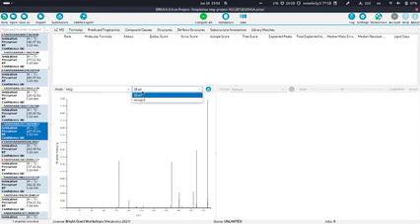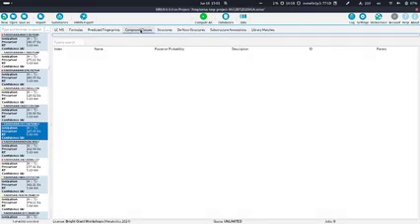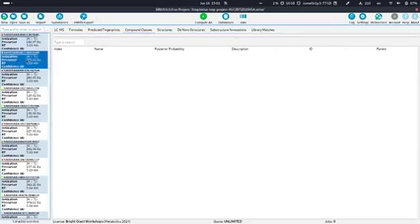But because in this example we only have one collision energy, we will only see this for the spectrum. I will show you the spectra view a little bit more in detail when we have actually done some computations. You will see for all the tabs, there is not much because nothing has been computed yet. So let's try to do some computations.